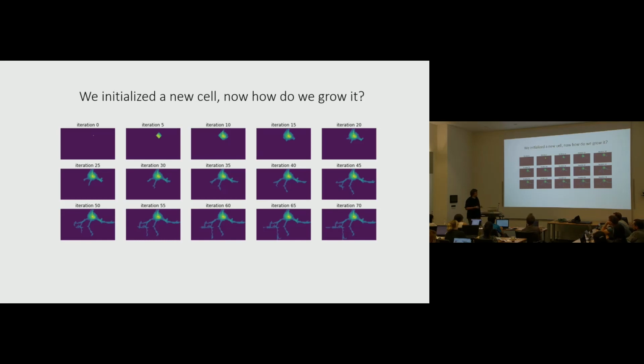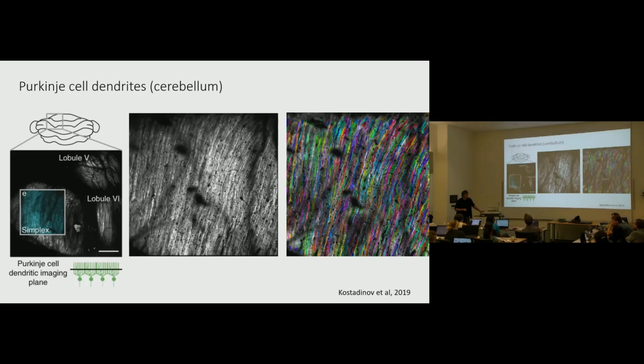It has one disadvantage, which would be hard to see how to fix. If it has a weak point, where maybe you have your long axon or dendrite, but it's kind of dim in some place, it won't be able to go past that to get to the other side. So you might get it split into two pieces, and then you'll have to merge those together. The reason it's hard to think how you'd fix that is that sometimes you don't want to over-merge things. You could say, I'm just going to merge all the ROIs that have similar activity, even if one of them is here and one is there. You still want some kind of spatial criterion, but deciding exactly if two things should be merged or not is perhaps for a later step after you've extracted the ROIs. You have that parameter called connected or so.